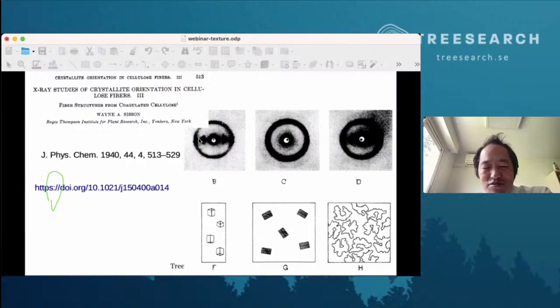So this spacing is the distance between... So you have a flat pyranose ring, and in the case of cellulose II, they stack first with the hydrophobic plane, which is distanced at about 4 angstrom, and then you have this distance, which is the distance between the stacks of hydrophobic sheets, which is now parallel to the film.